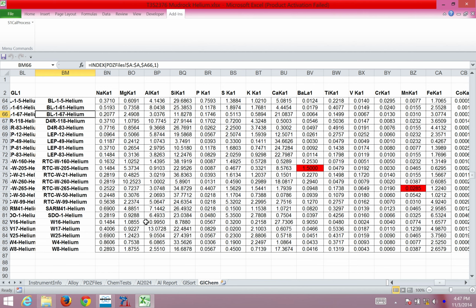First, a couple notes. This is a plugin into Microsoft Excel, meaning that most normal functional Excel uses are present, but we've added a few using macros. You'll want to make sure your Excel version is compatible with macros and compatible with these particular macros. If you have any questions, please don't hesitate to contact us at Bruker.